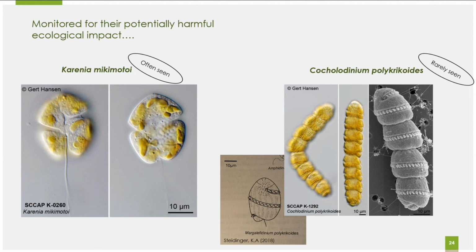And they have this distinctive, you can see it really clearly in this picture, spiral-shaped cingulum. So it's not only displaced, but it's very displaced and it comes around in this spiral here. So that's distinctive of it. And you can see it here too in this scanning electron microscope image, starting here, then wrapping all the way around. So you may or may not ever see that.